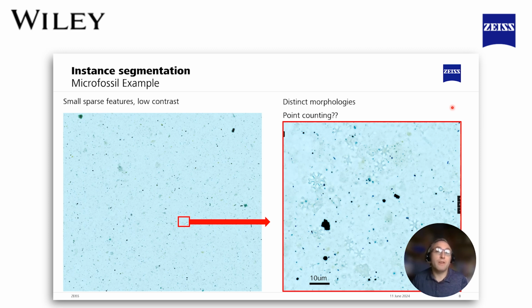And the reason this is so hard is because we're looking at something that's quite low relief, with lots of variation in it in terms of specks and flecks of other materials. But when we look close up and increase the contrast a little bit, we can see that there's these little star-shaped fossils. There's discoaster samples. And there's lots of these. There's slightly different sizes. And the important thing is, in terms of their pixel color, if we were trying to use traditional semantic segmentation, is pretty much exactly the same as the background and all of the variation within the background. There's no way we'd be able to pick out these incredibly distinctive features with a traditional segmentation technique.